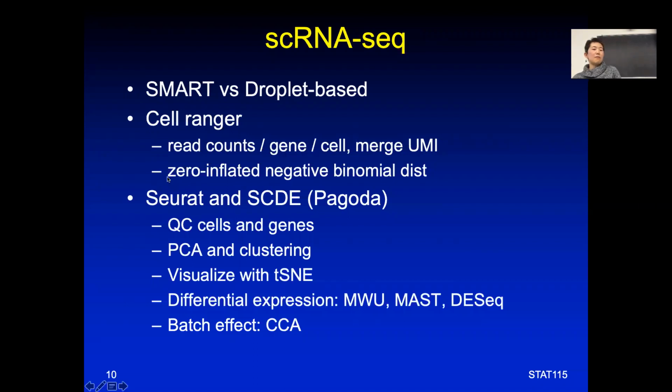And so by this time, people believe that the single-cell RNA-seq reads mostly follow a zero-inflated negative binomial distribution, which is, if this gene is a dropout, you have nothing. Even if the gene might be expressed at some high level, for some reason you just didn't get it at all. And so those will all just get zeros. It's only when it is not zero that it follows the negative binomial distribution.